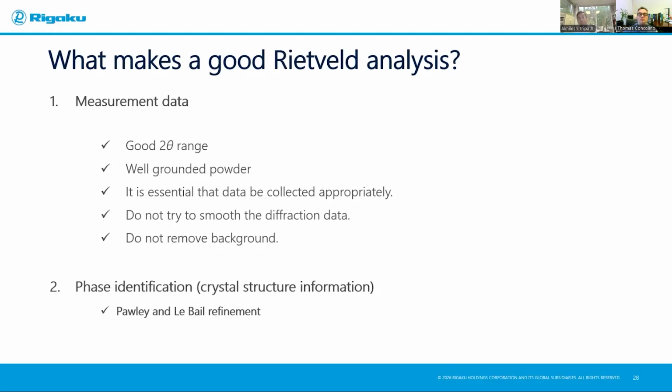We still fit the whole powder pattern, but one of the phases is fitted just as profile fitting using the integrated intensities of the peaks. So these 2 scientists, Pawley and LeBail, developed this, and it automatically comes into play in most of the Rietveld programs that you use.